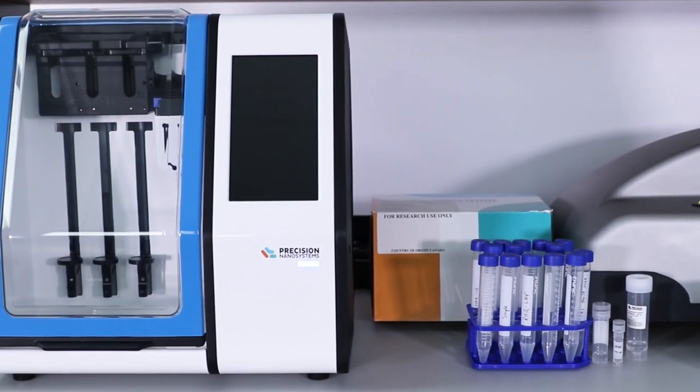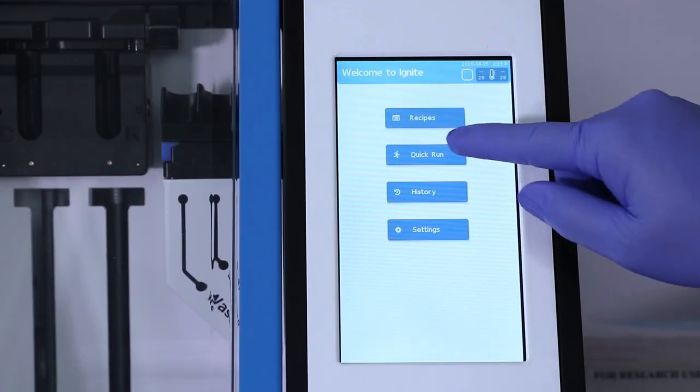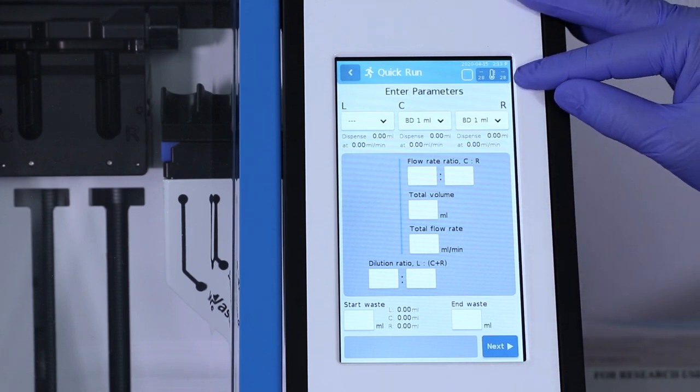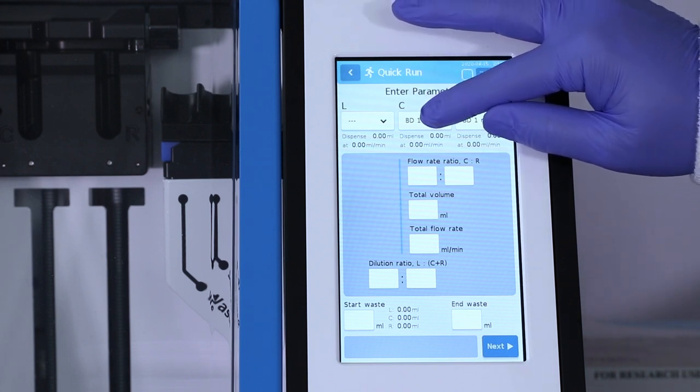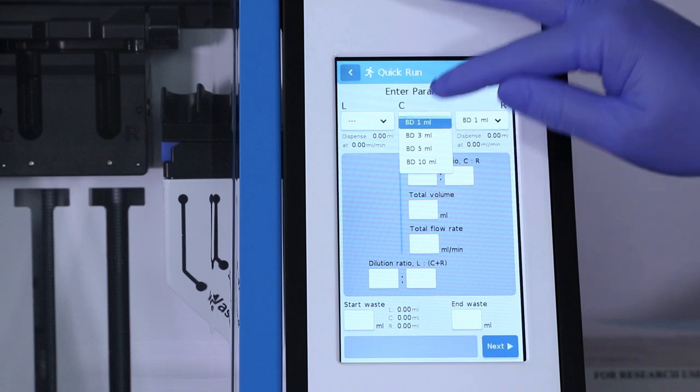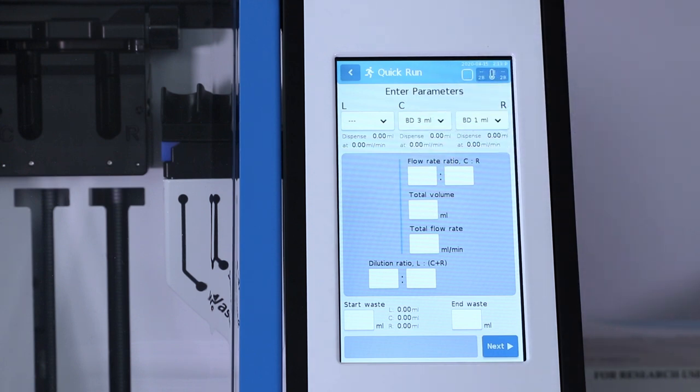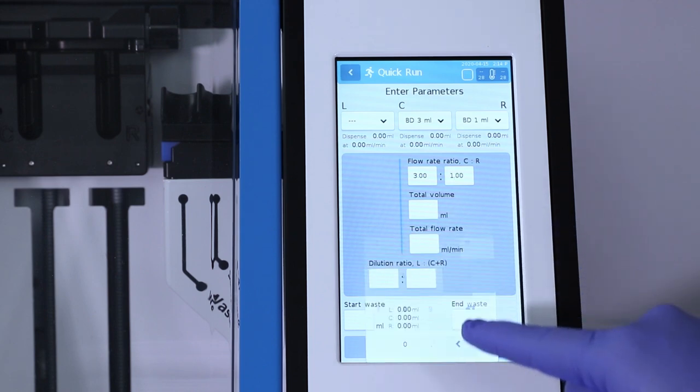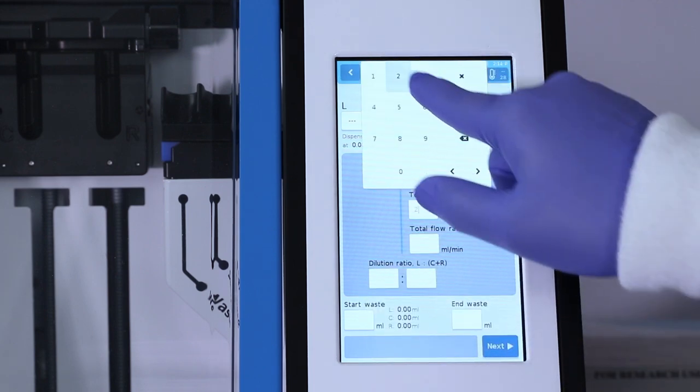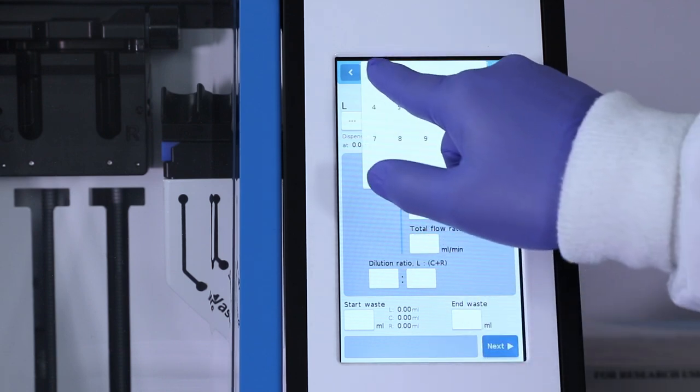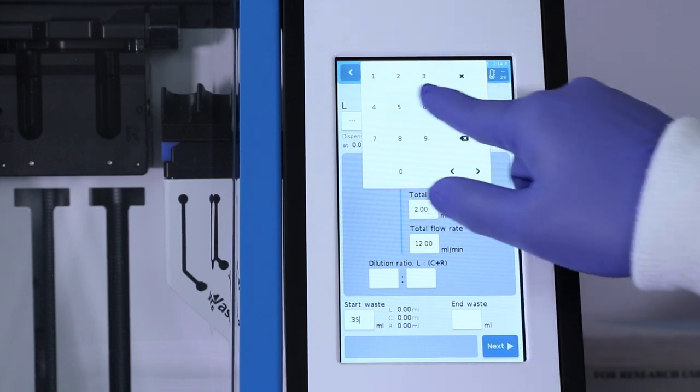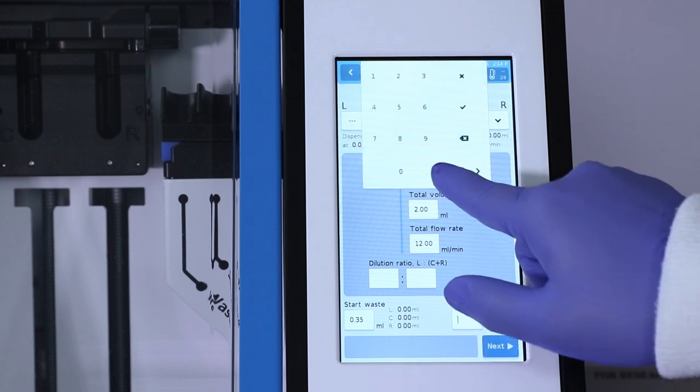So now we're going to prepare the NanoAssembler Ignite for the formulation. I'll use the quick run function, and in here I'll be able to set the different parameters that we'll need. We'll select the type of syringes that we'll be using in this experiment. For a 2 mL formulation, I'll need a 3 mL syringe on the C inlet, and a 1 mL syringe on the R inlet. Our flow rate ratio here is 3 to 1, which I'll enter here on the touch screen. Our total volume here is 2 milliliters, and our total flow rate will be 12 mL per minute. I will also be including a little bit of start and end waste, 0.35 for start waste, 0.05.